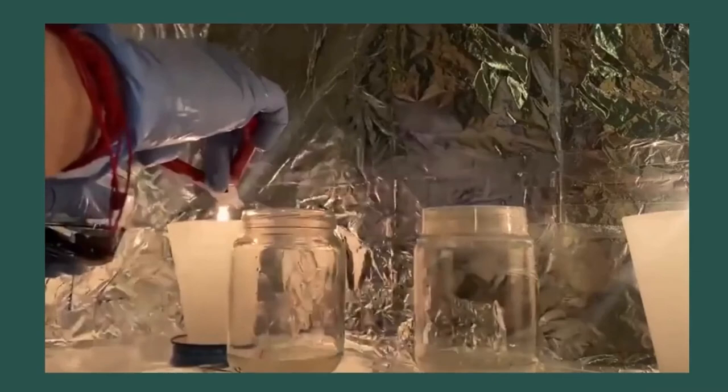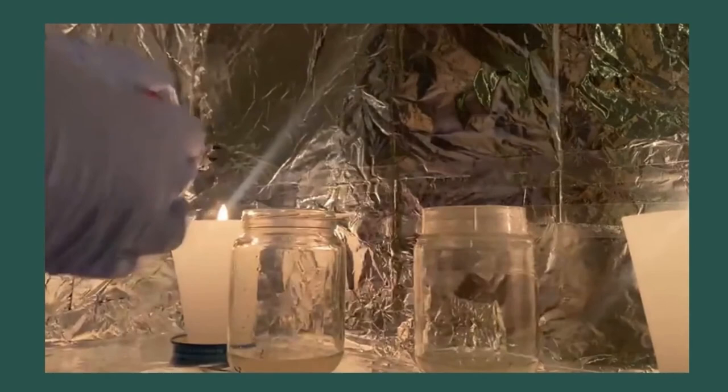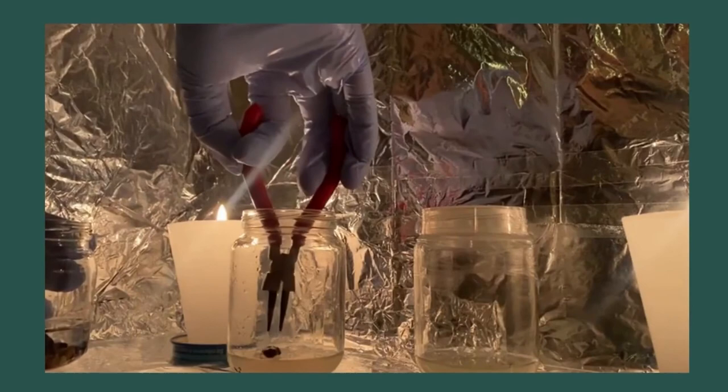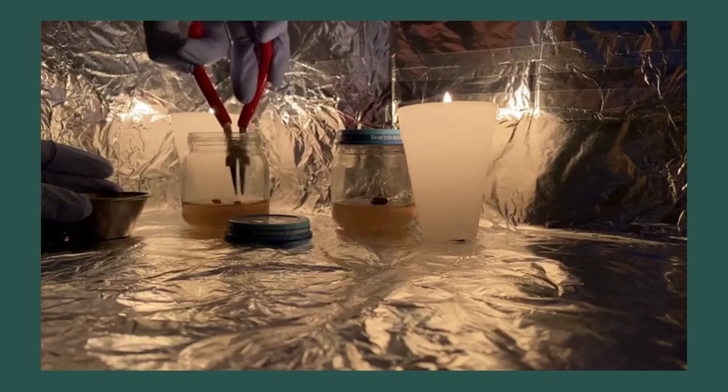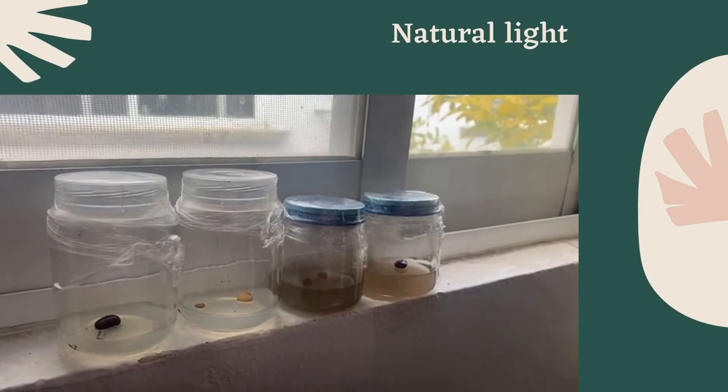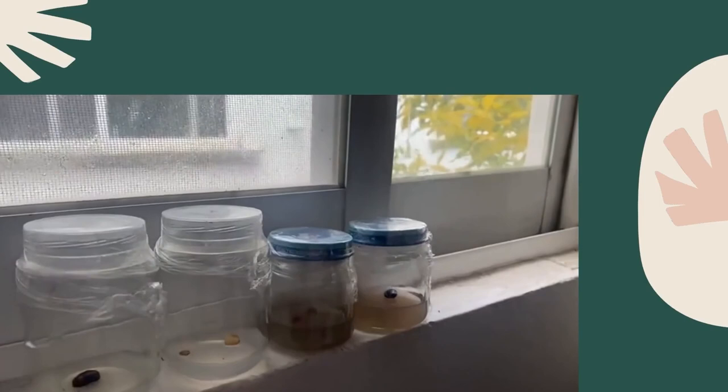Once the seeds were sterilized, I proceeded to sterilize the laminar flow hood with alcohol and culture the seeds inside the flask. I worked with 2 candles and tweezers that were previously sterilized with alcohol. I put the cultures next to a window so they can get natural light and I closed them really well with adhesive plastic to prevent the entrance of dust.